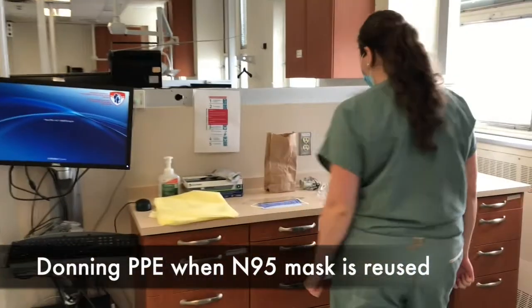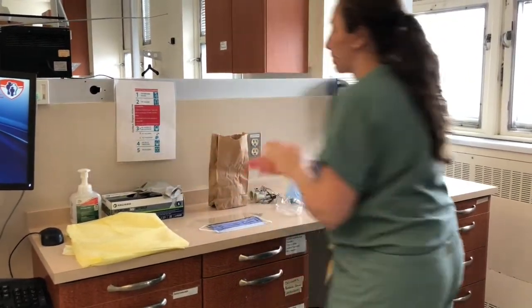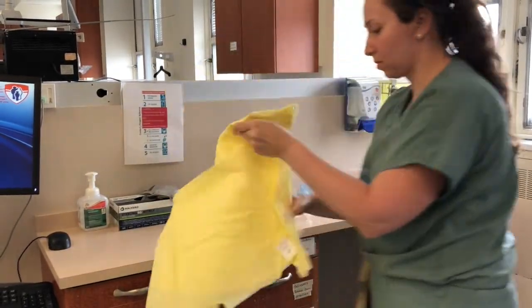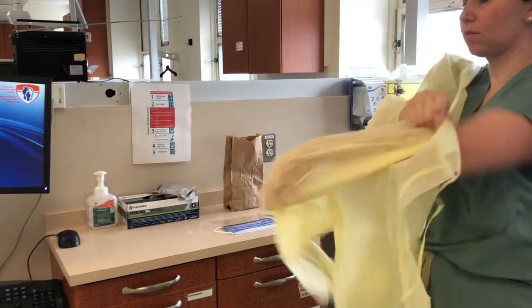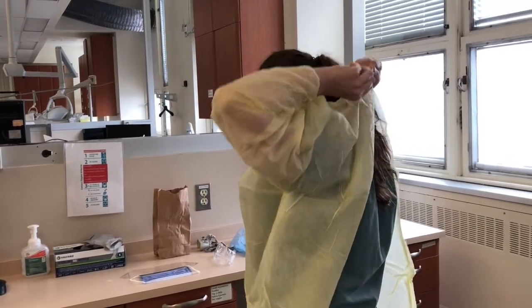Proceed to the donning area. Use hand sanitizer, ensuring all surfaces of your hands are covered, and rub for 15 seconds. Apply your gown, fastening at the neck and waist, ensuring that your scrubs are completely covered.